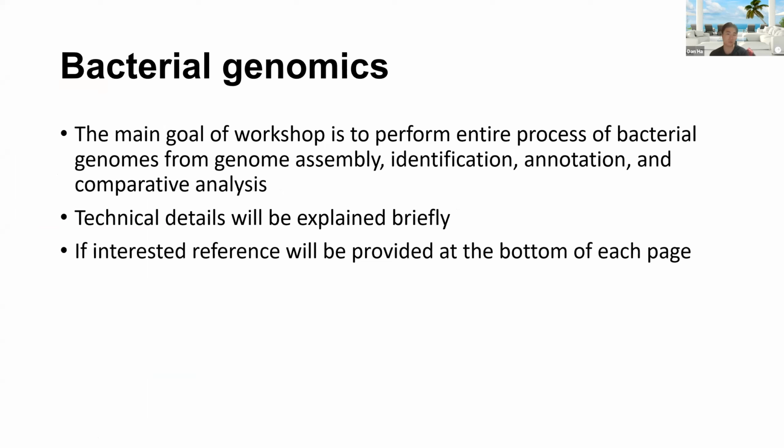So the main goal of this workshop is for you to perform the entire process of bacterial genomics, starting from genome assembly and genome-based identification and annotation, and then finally the comparative analysis.